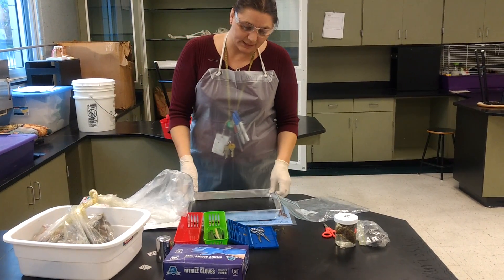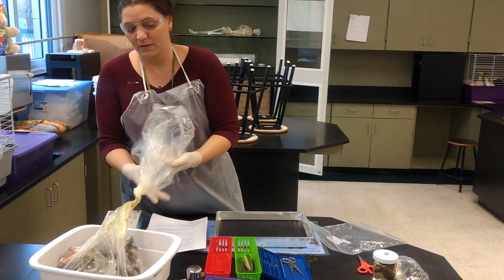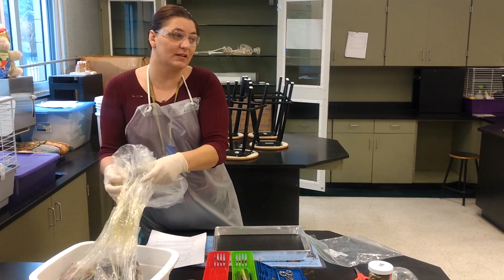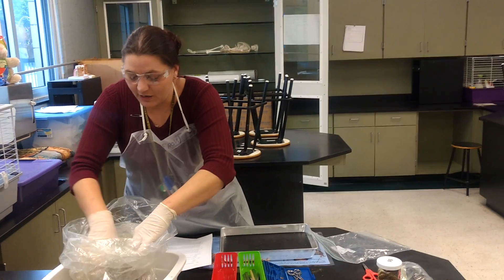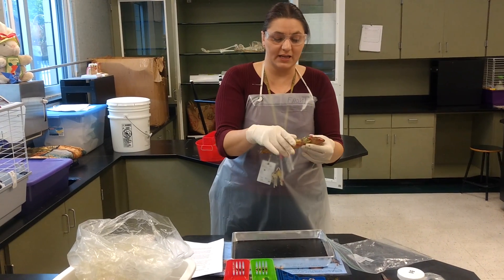I'm going to go ahead and take my dissection pan over to where the frogs are. This is going to smell — if anyone has a problem with the smell, I do have peppermint oil; it helps out a little bit. You will take a frog and grab it very gently please.